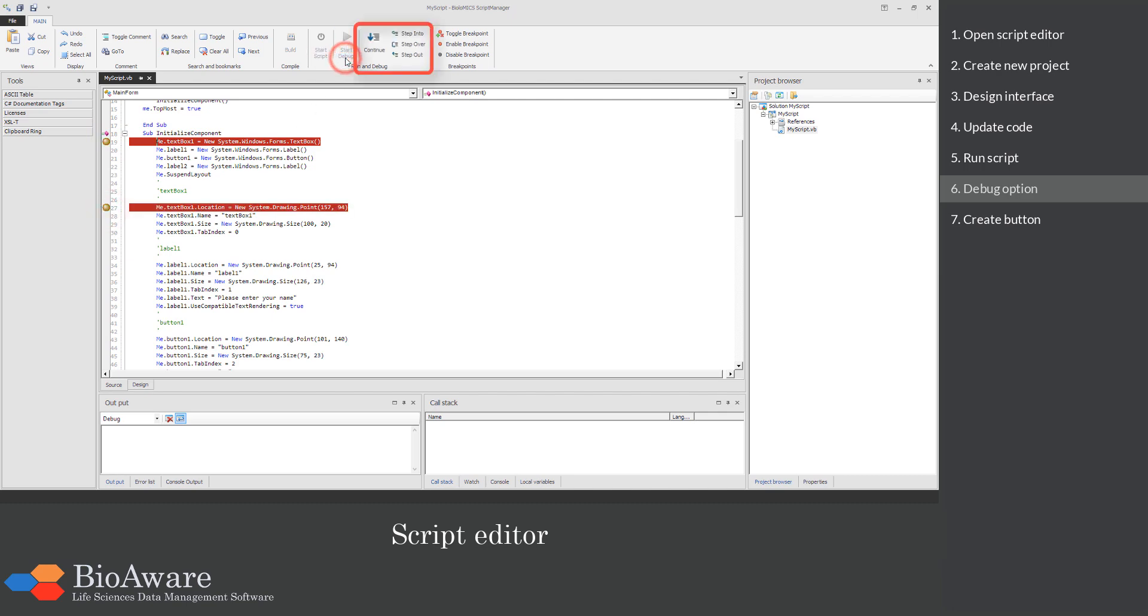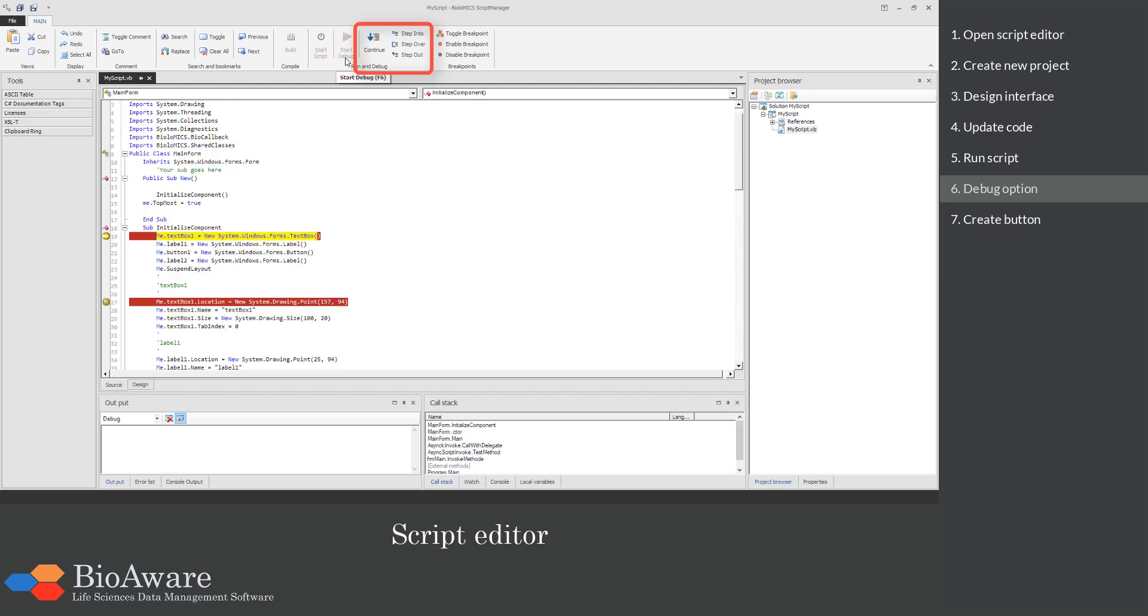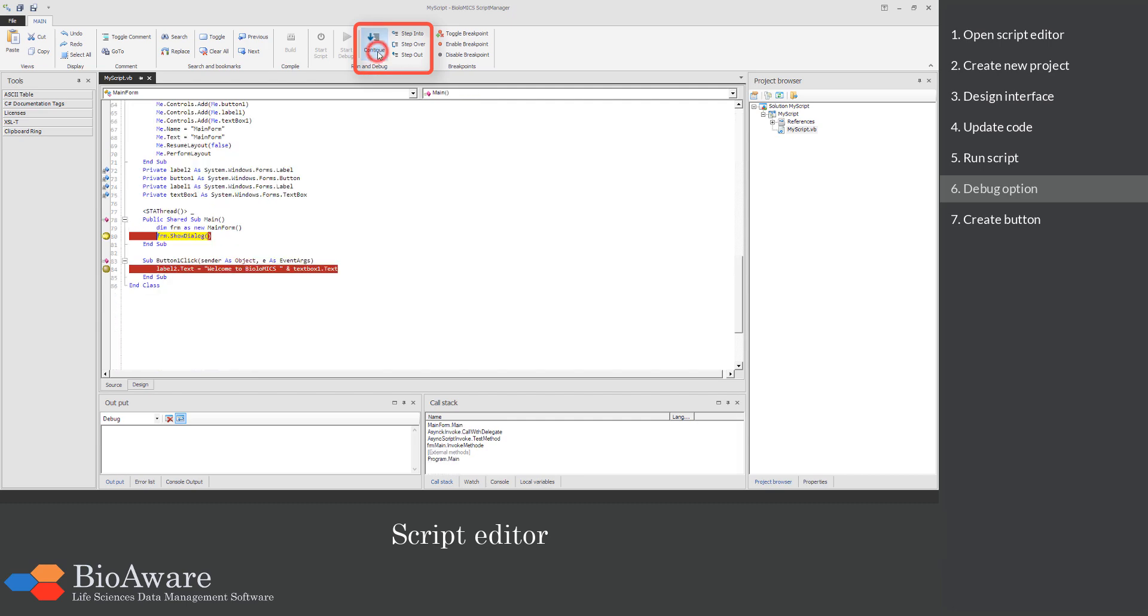Use the buttons in the ribbon on top to jump from breakpoint to breakpoint or to step into or over a given action or line.